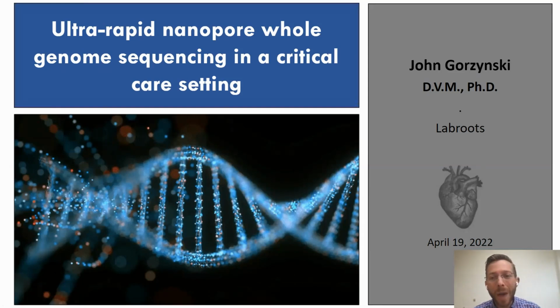I'm going to show you how advancements in these sequencing technologies have enabled us in the Euan Ashley lab to develop an ultra rapid genetic test for critically ill patients, which is an accomplishment that has been awarded a Guinness World Record for the fastest genome sequencing technology.